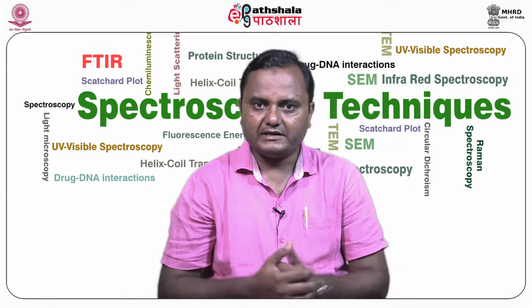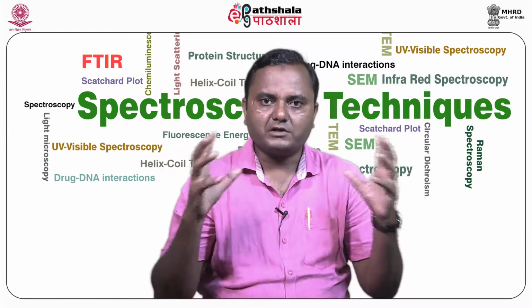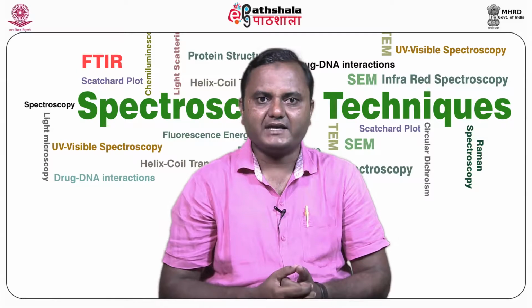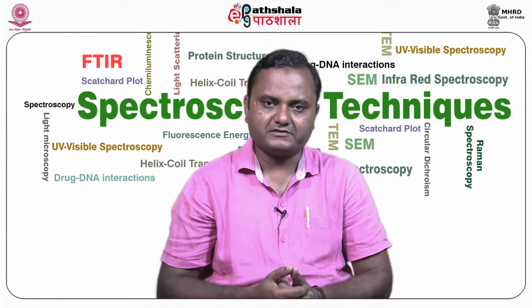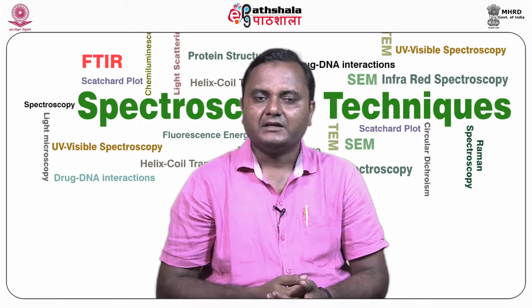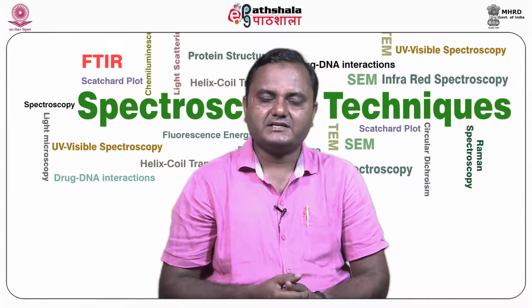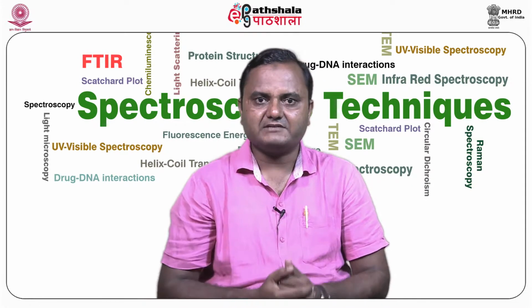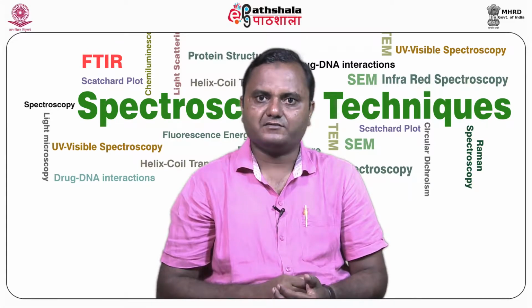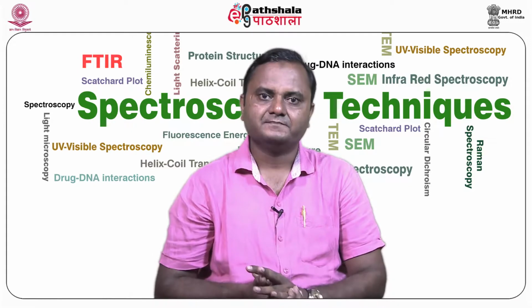When using LALS, the Debye plot is reduced to a single point which is very close to the y axis, and therefore it equals 1 over molecular weight for all molecules. The LALS system again has a large number of advantages, such as it measures the light scattering very close to the axis of the Zimm plot. So, the calculated molecular weight has the highest accuracy.